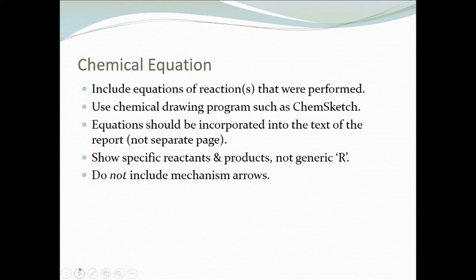Chemical equation. Again, show the equation that you're doing for the specific compound. Don't show a generic one for an alkyl halide, an alcohol going to an alkyl halide. Show the specific one. So if your unknown was 1-butanol, you would draw the structure for 1-butanol going to 1-bromobutane.